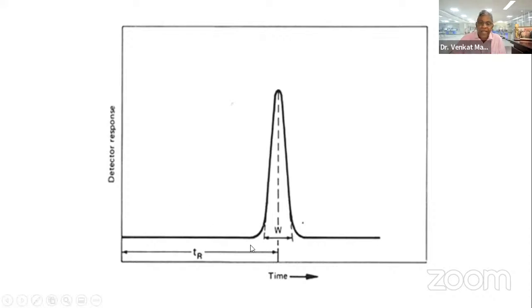If you look at this peak very clearly, you draw a line. You do this on a piece of paper. Then, exactly at the center line, you just fold your paper. When you do the folding, the peak on the left-hand side, the upslope, comes over and the peak has gone down. This is called a down slope. Both will superimpose upon each other.